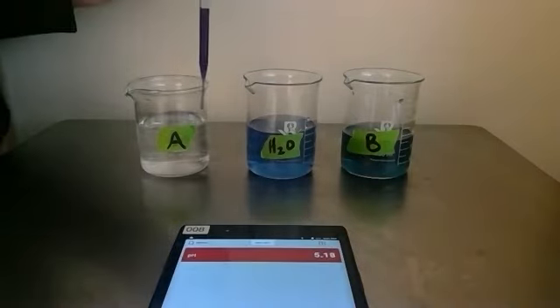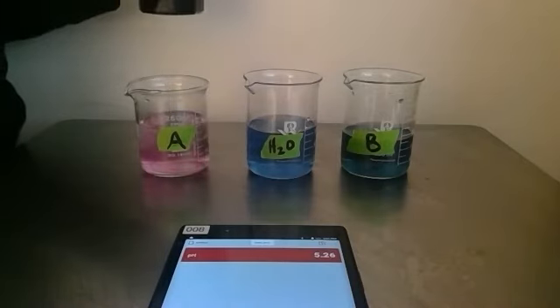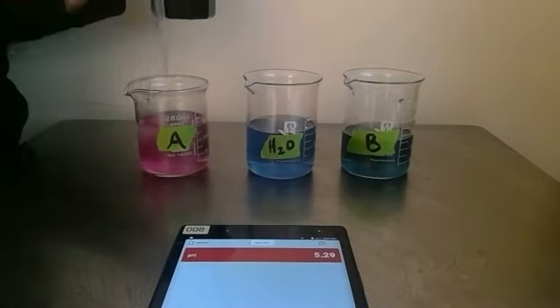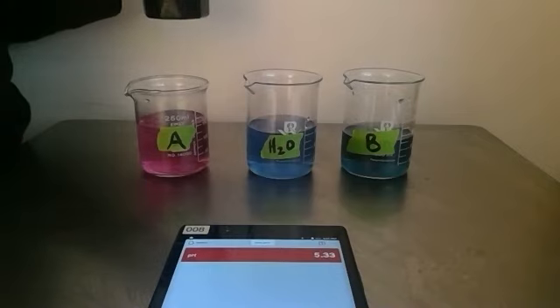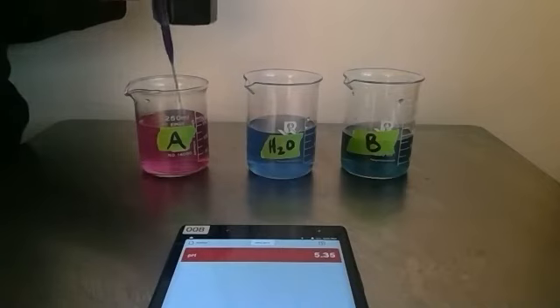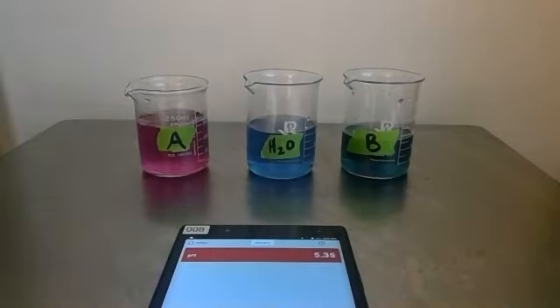This time I see a very pink magenta color. We can see that the greener or bluer something looks, the more basic the solution is. And if it's acidic, it's going to be a nice bright pink color. We can use this indicator, this butterfly pea flower tea, to visually indicate if we have an acidic solution, a basic solution, or a neutral solution. It's easier to see if it's acidic.